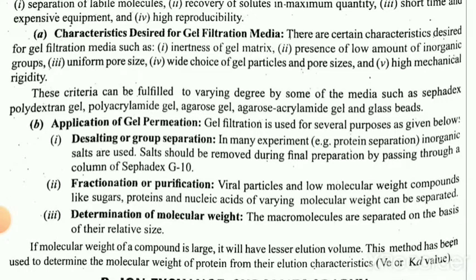Application of gel permeation. Gel filtration is used for several purposes as given below. Desalting or group separation. In many experiments, e.g. protein separation, inorganic salts are used. Salts should be removed during final preparation by passing through a column of Sephadex G-10. Fractionation or purification. Viral particles and low molecular weight compounds like sugars, proteins and nucleic acids of varying molecular weight can be separated. Determination of molecular weight.